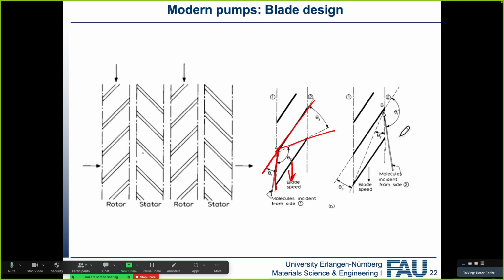And this is just the principle. So always remember, it's a differential pump, and the speed of the blade essentially gives us the pumping speed.